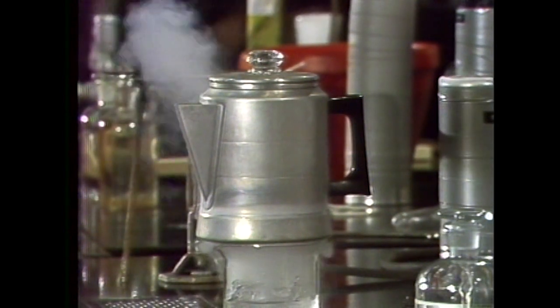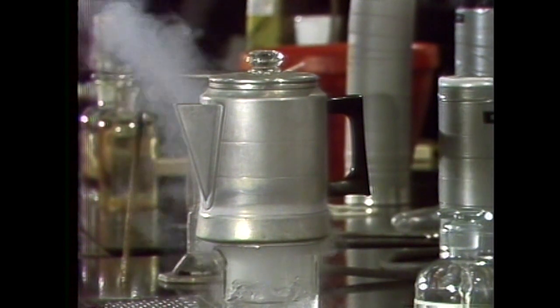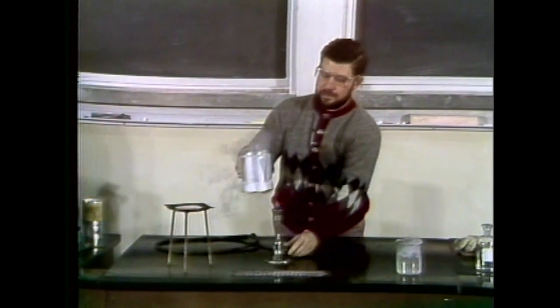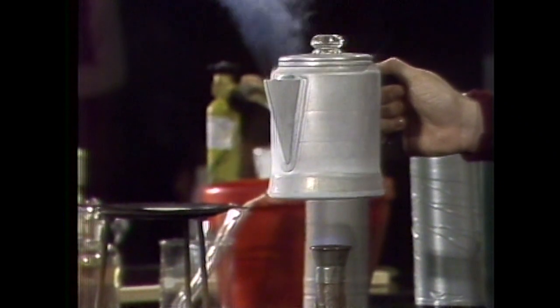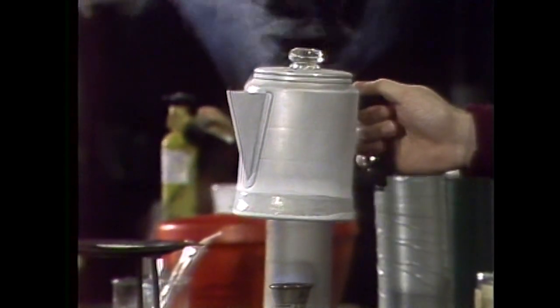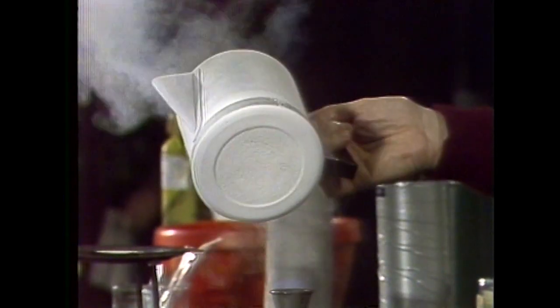Actually, there is another effect that I'd like to show you now, which is, if I want to help things out a little bit here, I'm just going to heat this a little faster by using this heat source here. And of course, the nitrogen boils off faster. In the process of this reaction taking place, we can make some observations about the changes that are taking place in the system. For one thing, it's getting pretty hot here, so I'm going to take it away from the heat.